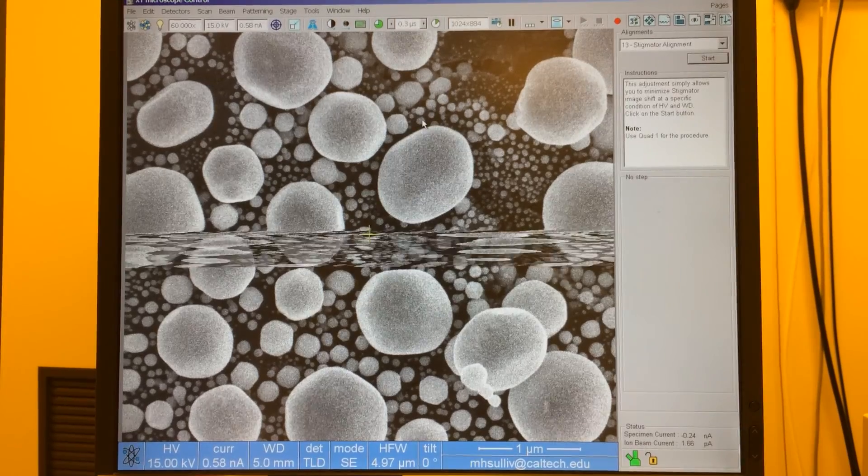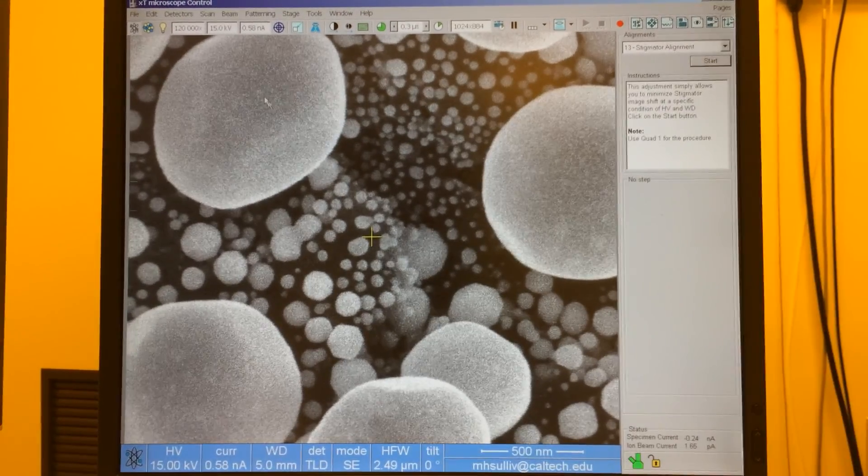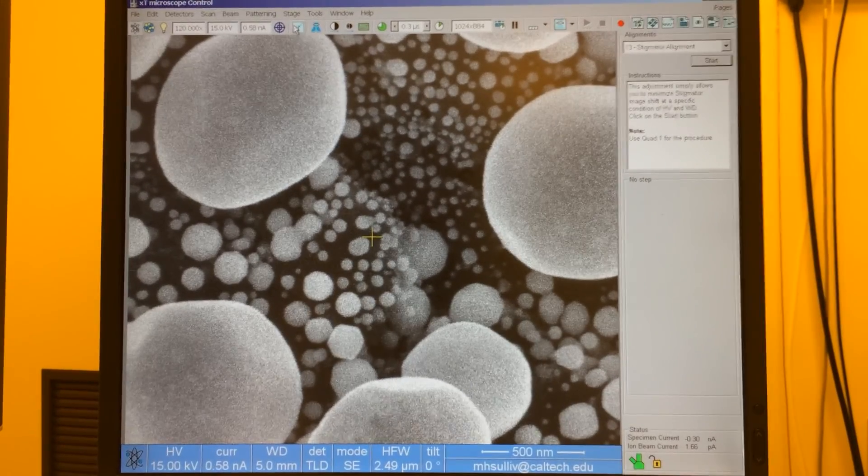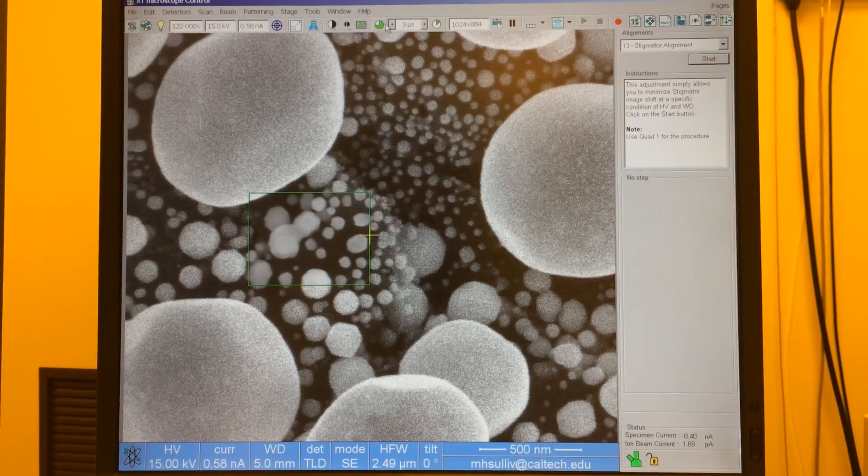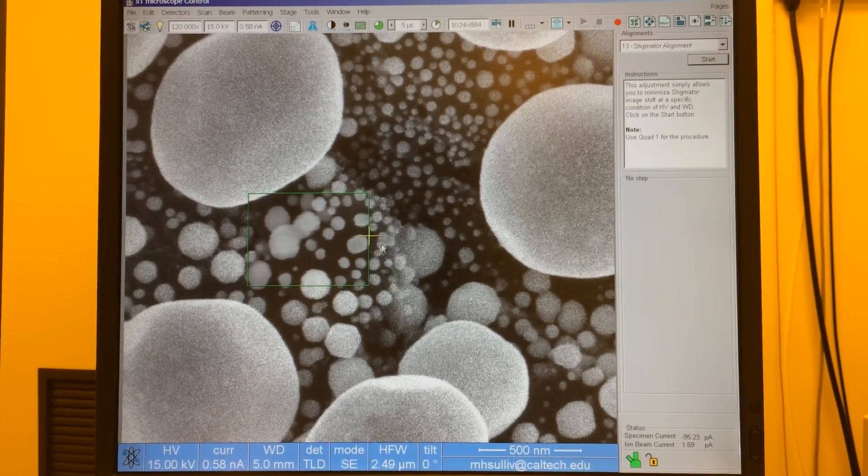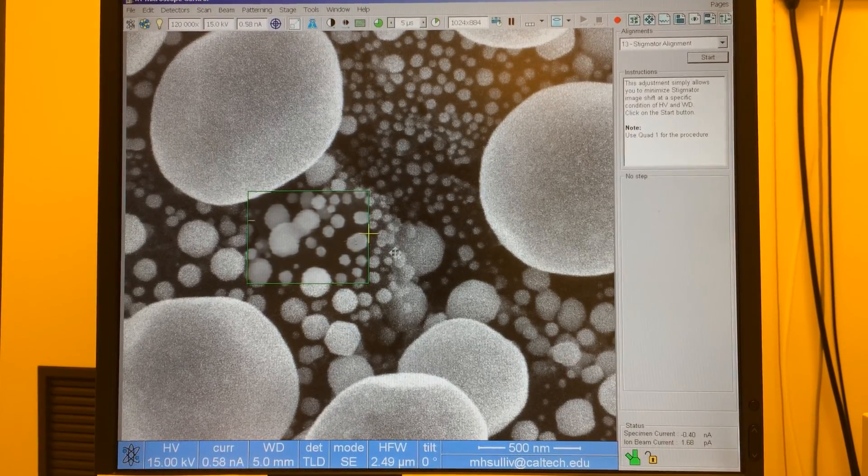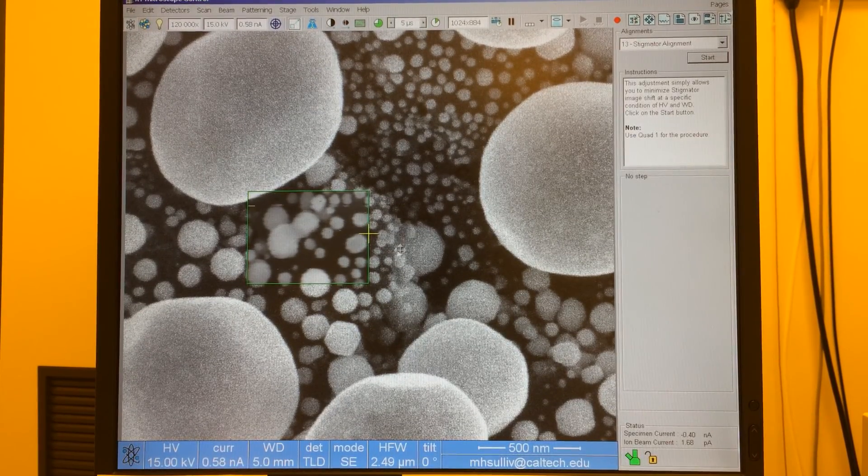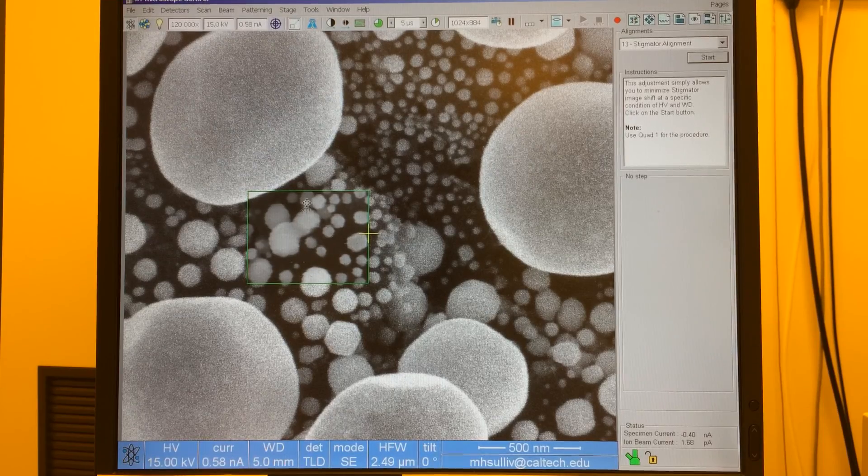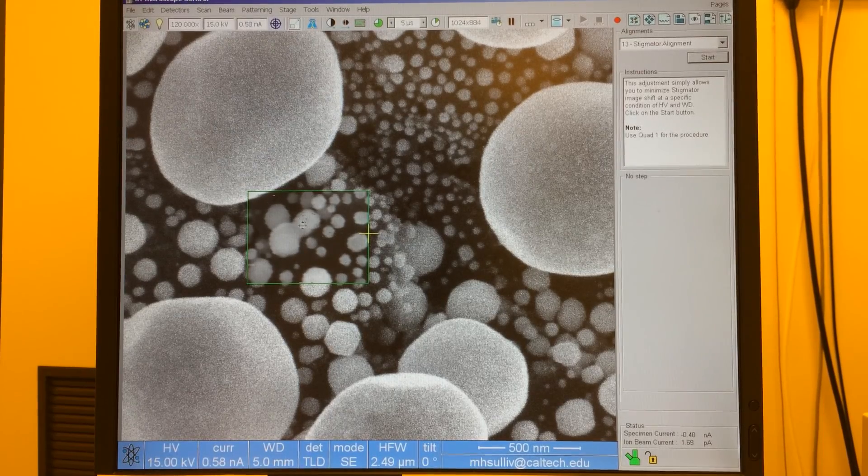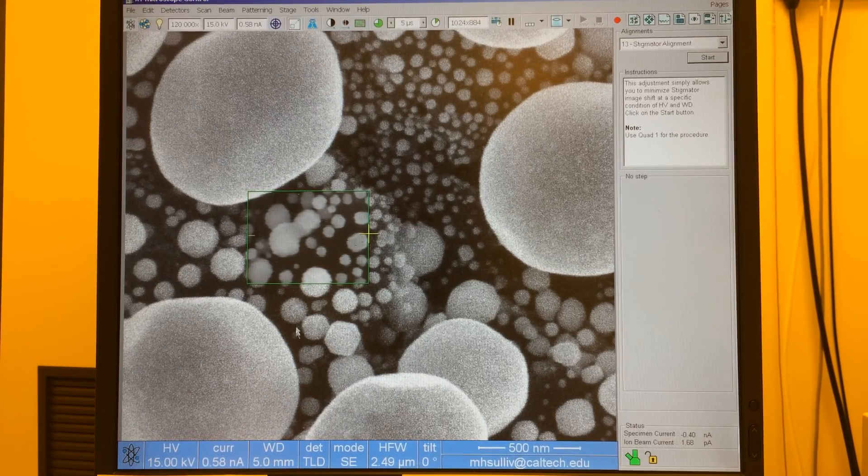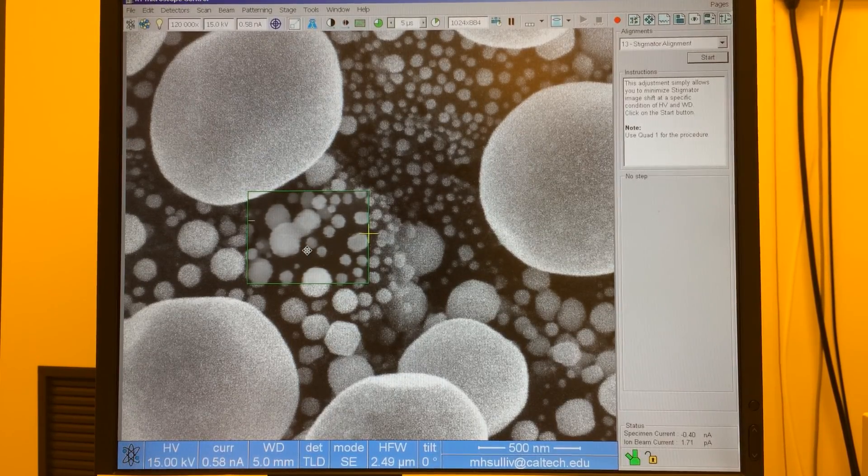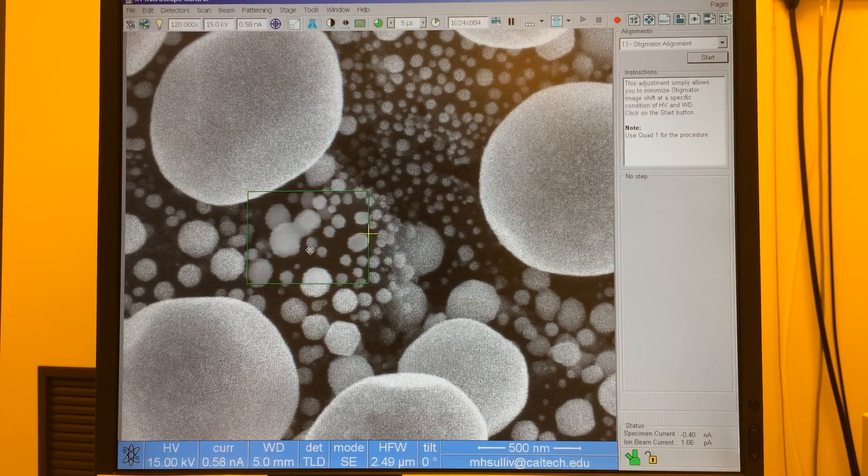If we zoom in more and use a reduced window which is what you're more commonly going to do for your alignment, as I shift right click I don't have very much shifting at all. And that means that my stigmator alignment is fixed.